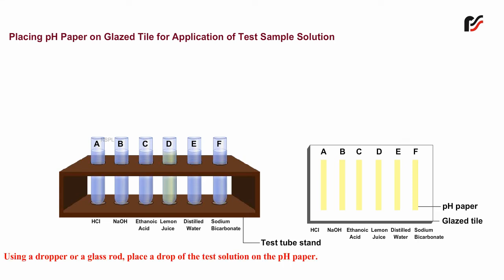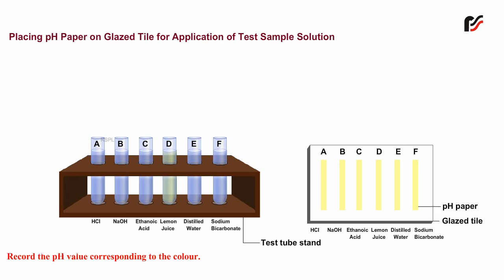Using a dropper or a glass rod, place a drop of the test solution on the pH paper. Note the color developed on the pH paper and compare it with the color chart of the pH paper. Record the pH value corresponding to the color.